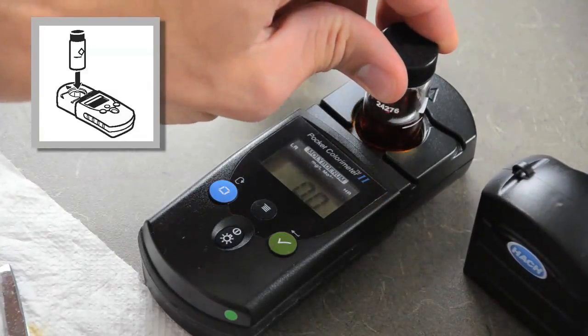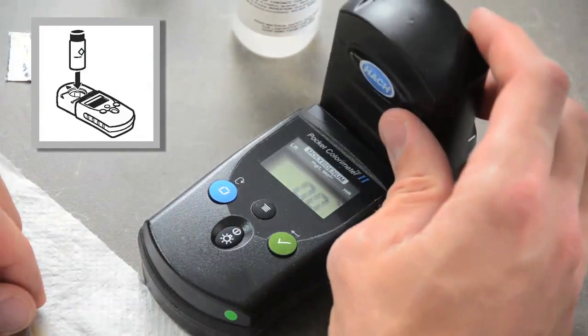Place the blank in the cell holder. Cover the blank with the instrument cap and press the zero/scroll button.